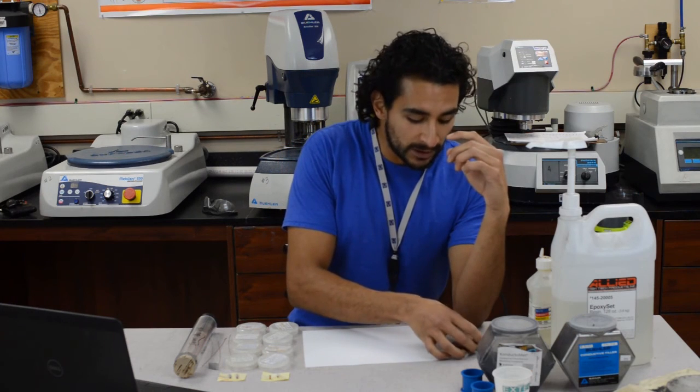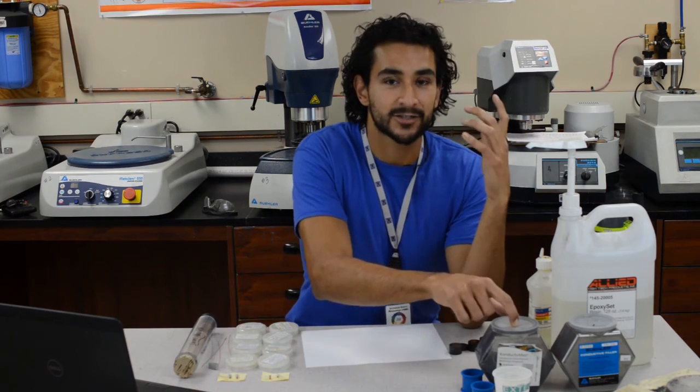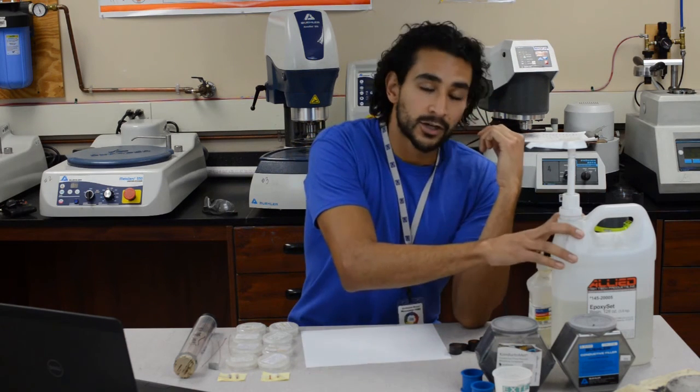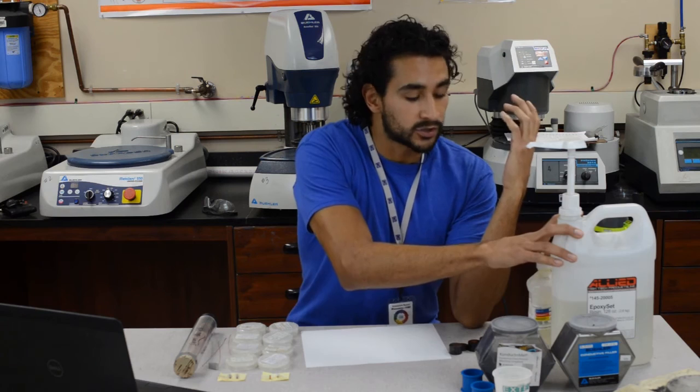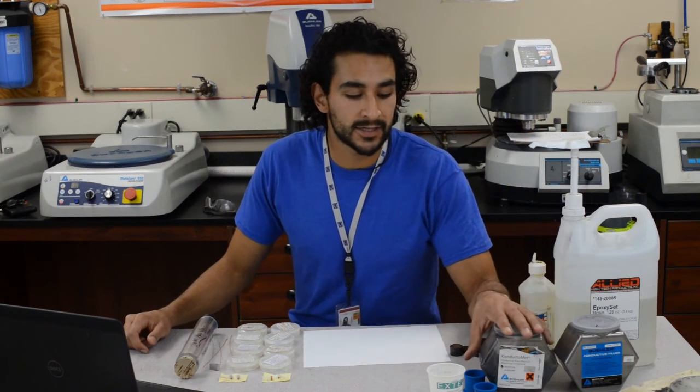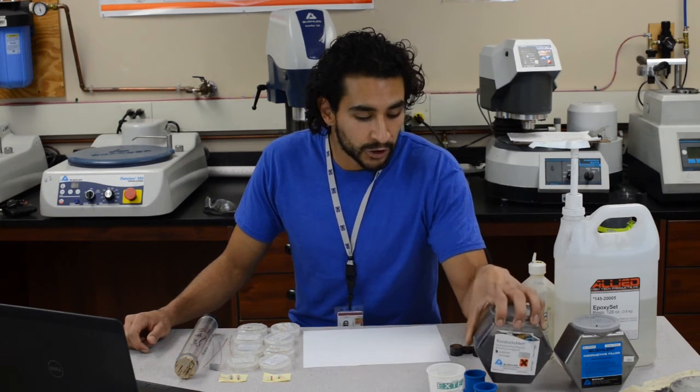You want the puck to be electrically conductive, and the Conducement is electrically conductive, so it's really good for the SEM. The epoxy is really good in case you don't want your sample to get too hot. A lot of people prefer Conducement because it fills in really well, it cures quickly, and it's very, very hard.